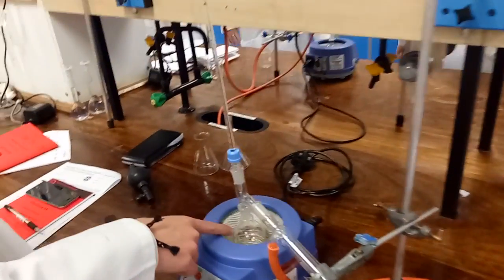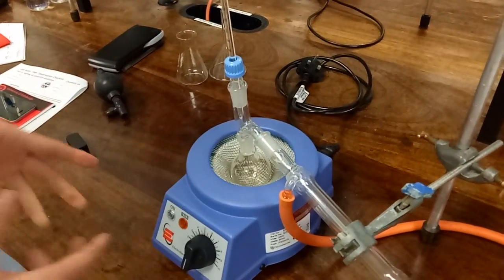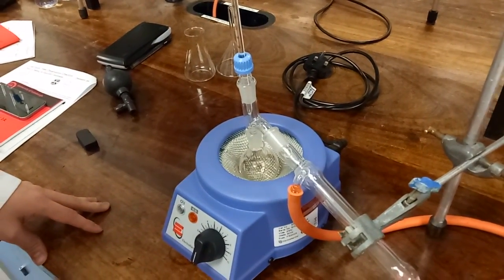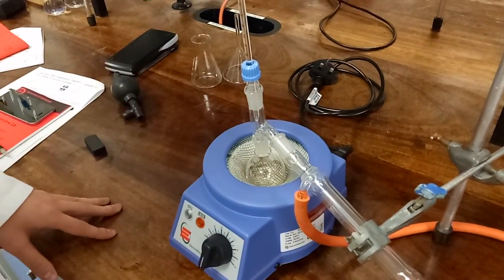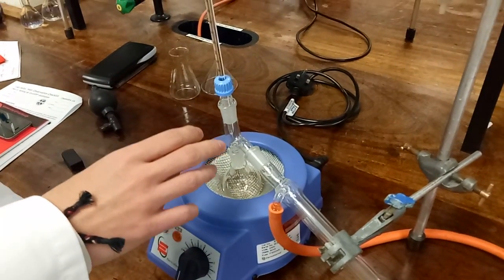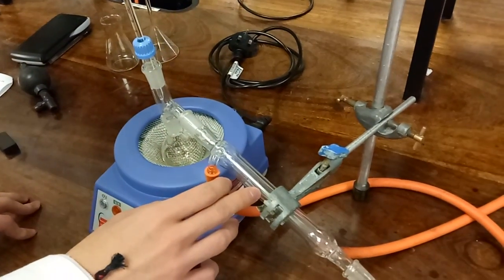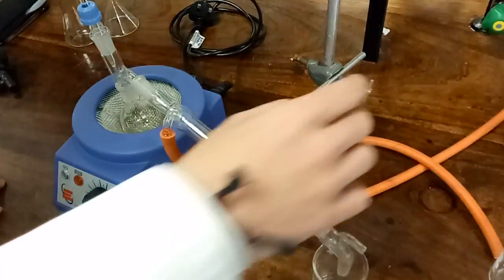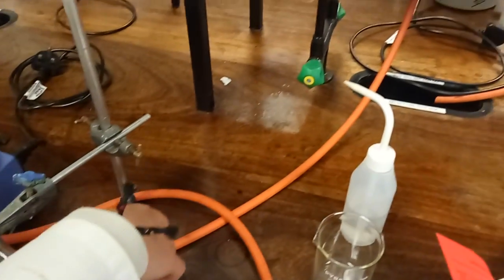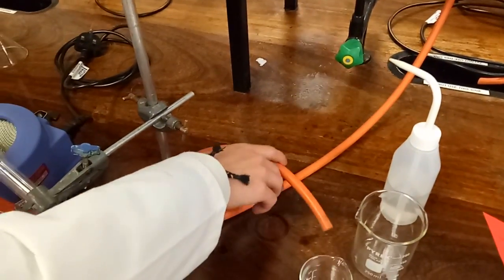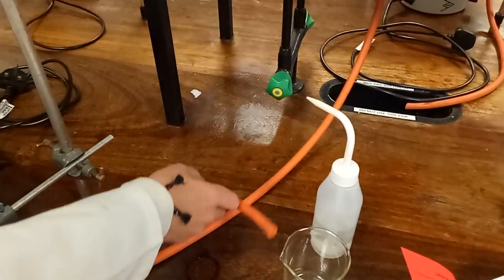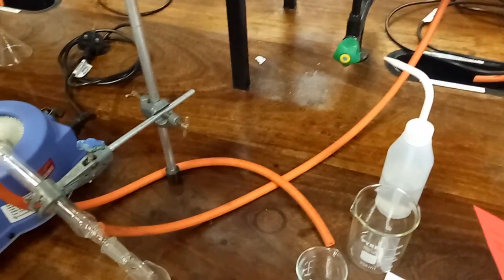In this flask here, you have the solution that you want to separate with various fractions in. It's connected to the Liebig condenser. You have two tubes, one going to the cold water tap and the other going to the sink. This tube isn't long enough, but normally it would be in the sink.